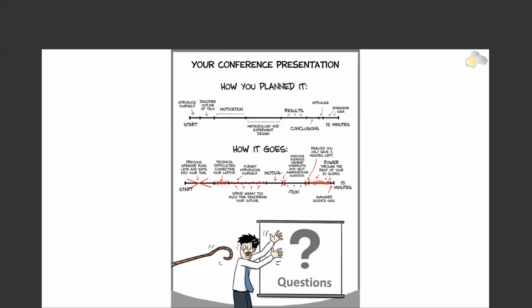And that's something that at least the Quasispecies spectrum reconstruction tool, Hexa Hedron, has been tested thoroughly by the implementation of the HIV samples, and the integration to the pipeline that was processing the HIV samples, and the DVG-profiler was also examined against multiple biological samples for reproducibility.